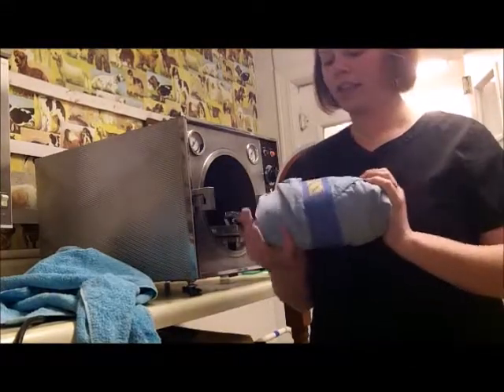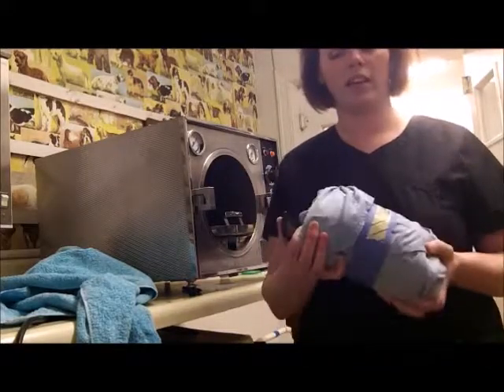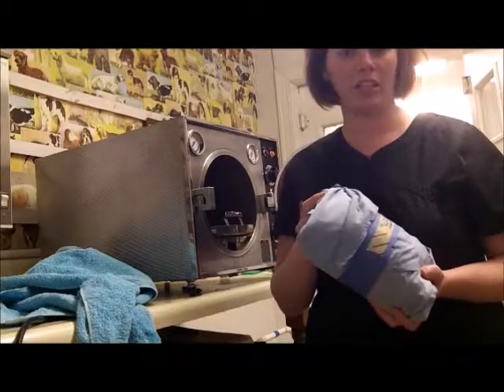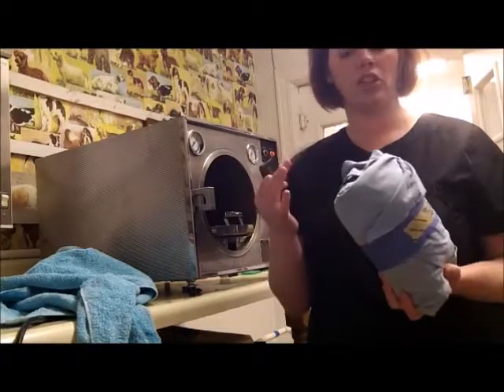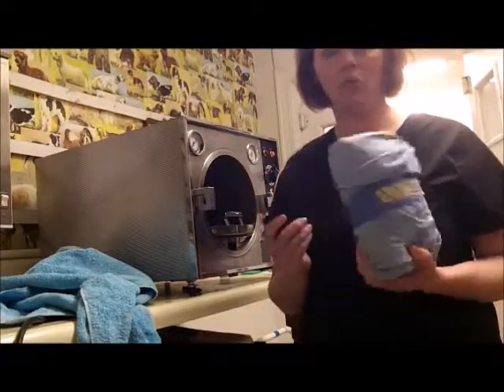Our pack has now dried completely, and as you can see, the indicator strip has changed color, so the outside of the pack at least has reached a proper temperature for sterilization. The inside indicator should also change color as well, and that is how you use the steam autoclave to sterilize packs.